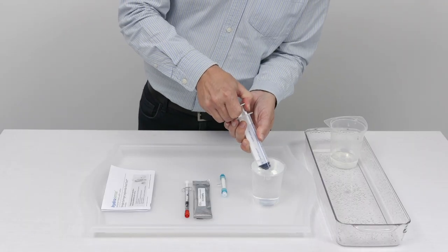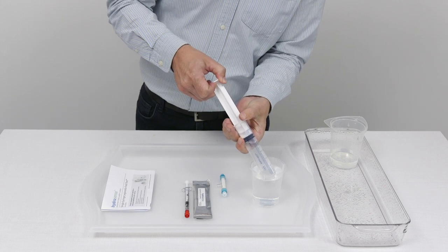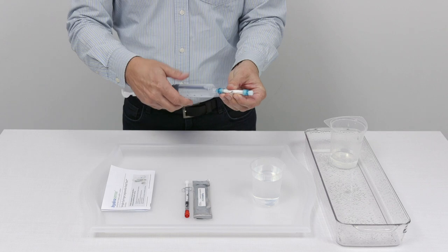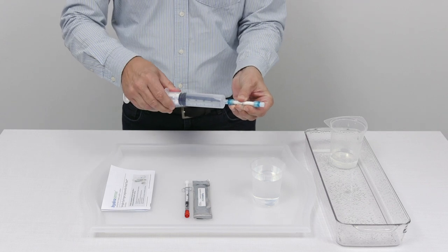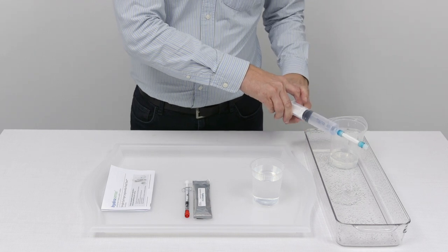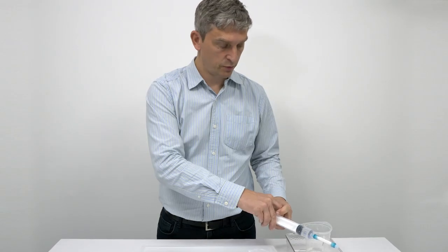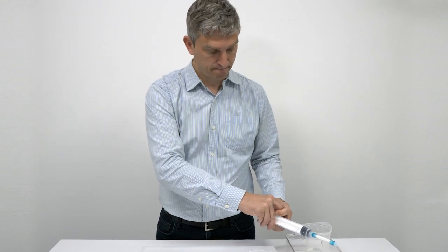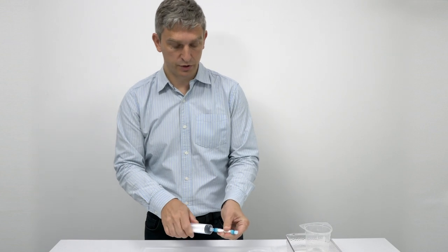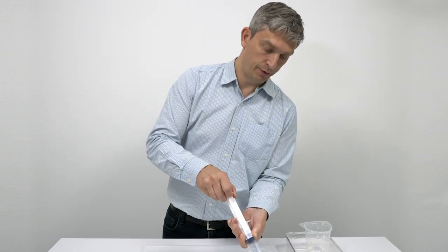So we take up the first syringe full, draw up to the 50 ml mark and then we attach it to the syringe and then we squeeze the liquid through. Now it should pass through quite easily but you may find that with turbid solutions it might take a little bit more pressure to pass the liquid through the filter.